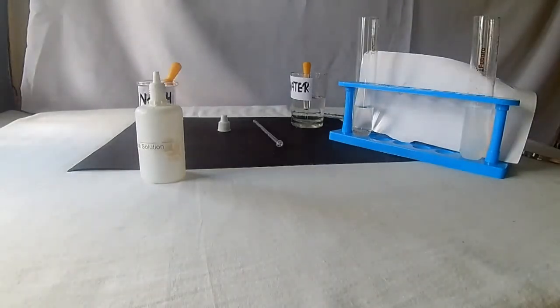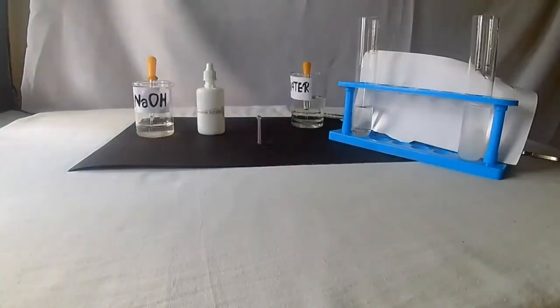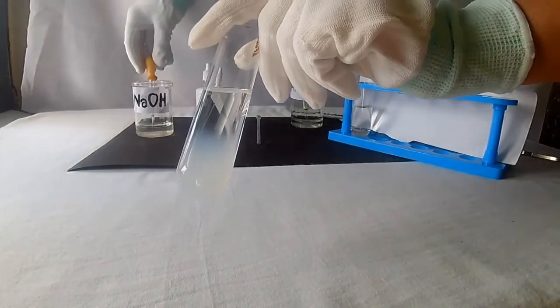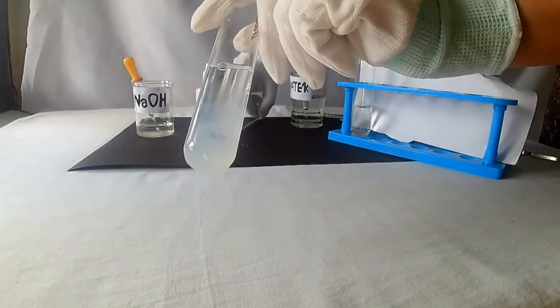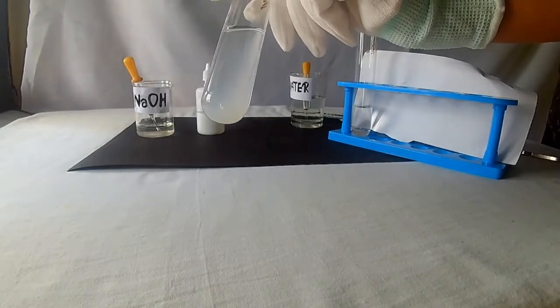Now let us see what happens to the salt solution when excess sodium hydroxide is added. Oh yes, it dissolves. Add few more drops of sodium hydroxide to check it correctly. Stir it well.